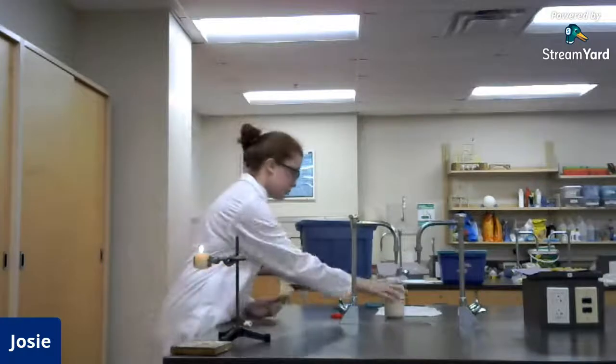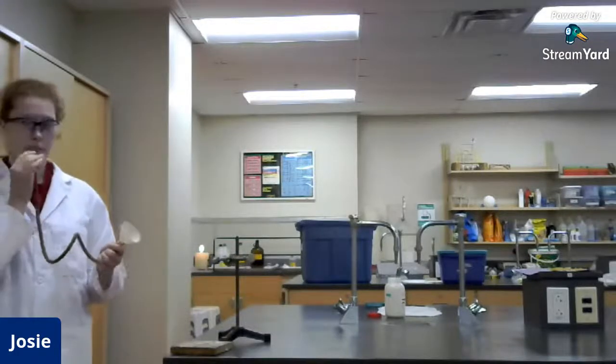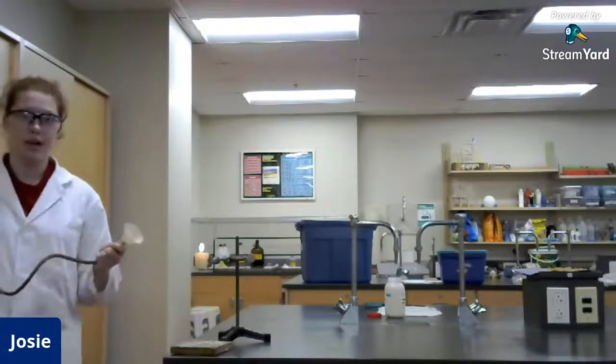Move this aside because it's flammable. We don't want that in the way of the fire. And then all we have to do is blow into the tubing, which is going to shoot air out and cause the powder to launch through the fire. And then you're going to see what happens.